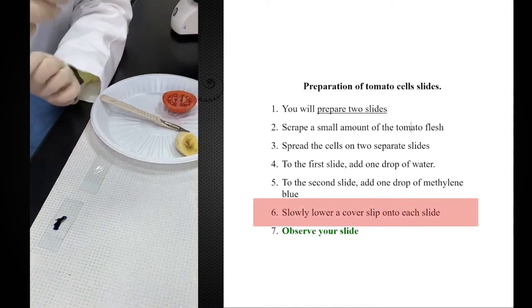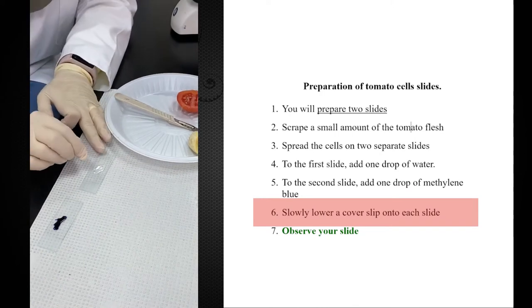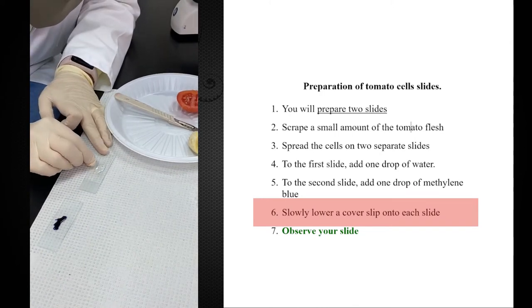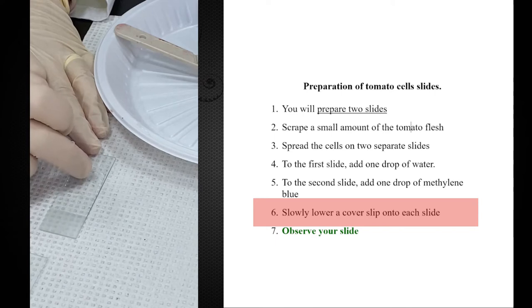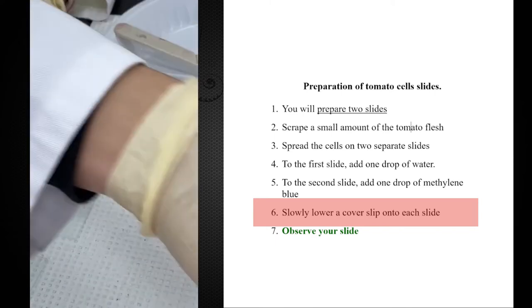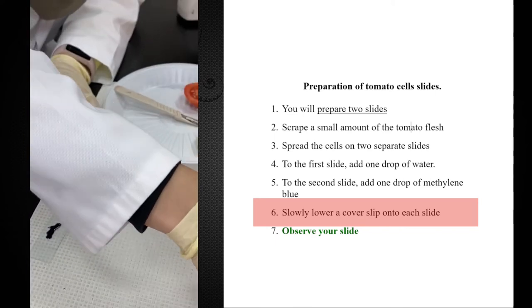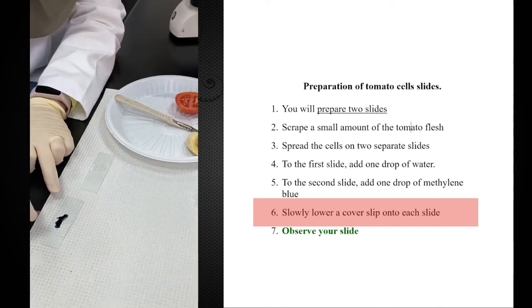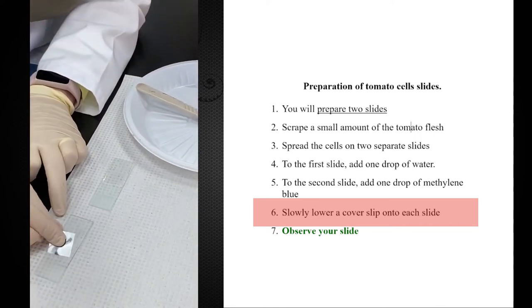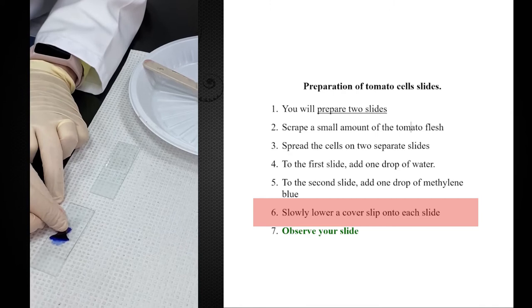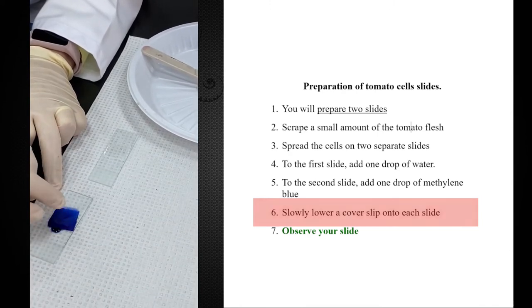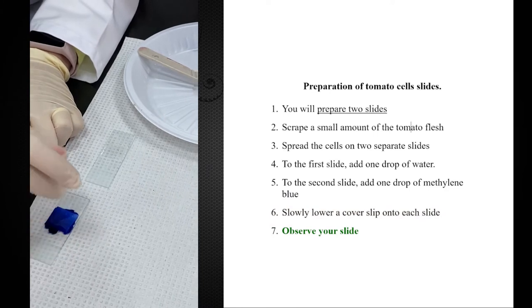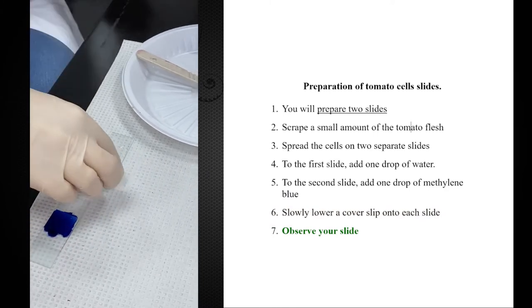Then I take a cover slip and I touch the liquid with the cover slip and I start lowering it slowly, slowly, to avoid air bubbles. Once it's in place, my slide is ready. I'll take another cover slip and I will put it on the methylene blue. Actually, one drop of the liquid would have been enough. I have excess liquid. Anyway, when you have excess liquid, you can wipe it with tissue from the sides.